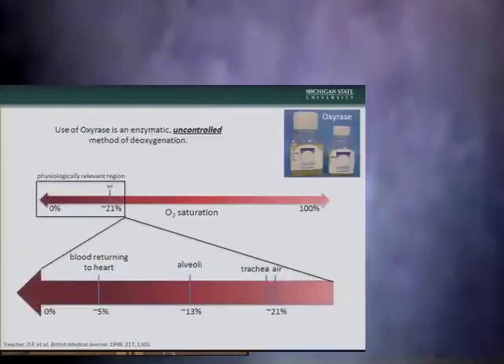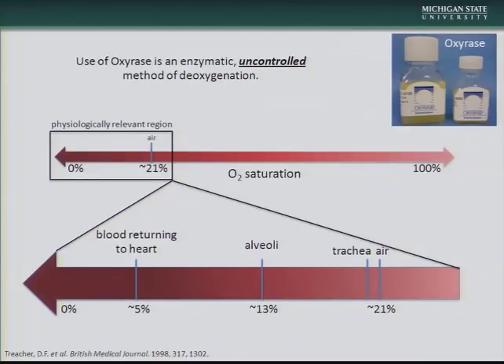Okay? So these are some of the kind of measurements then that we can make on these controlled in vitro platforms. However, we do have one problem here with our system, and this is, again, why you get new grad students and you challenge them to do new things. We made our systems hypoxic using this oxyrase, which is, again, I don't even really know what it is. It's an enzyme that basically chews up all the oxygen in your system. We don't know what it's doing. We don't really have good control of it.